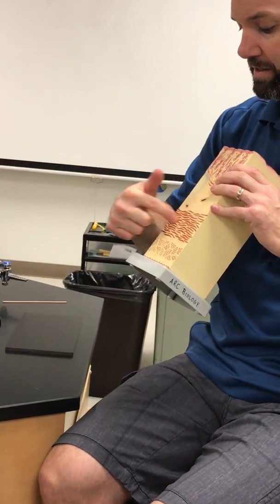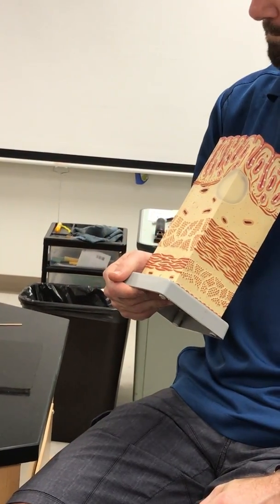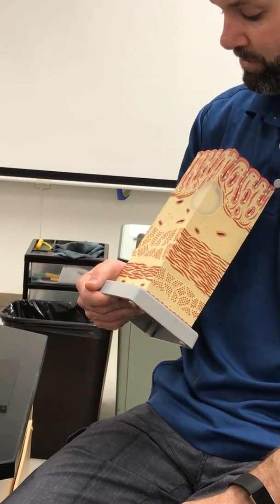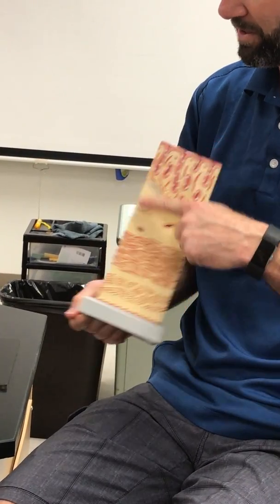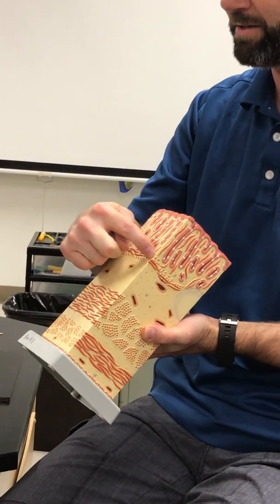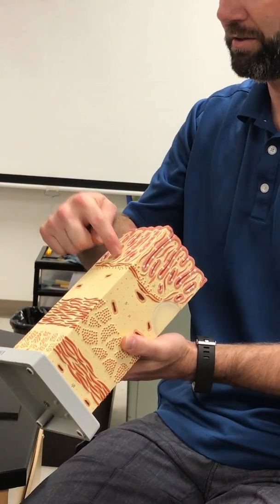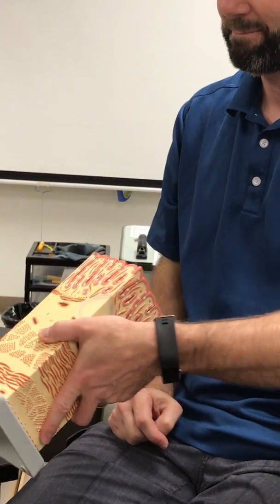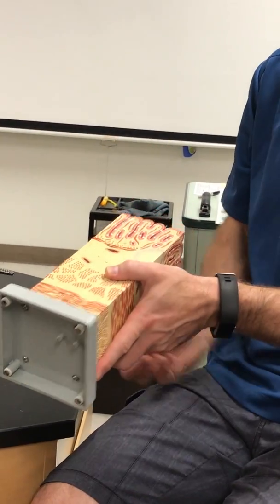And then what layer is this? So inner circular, outer longitudinal. From here to here is all submucosa, and then from here up, mucosa in this layer, muscularis mucosa, and all of these, intestinal crypts or intestinal glands.